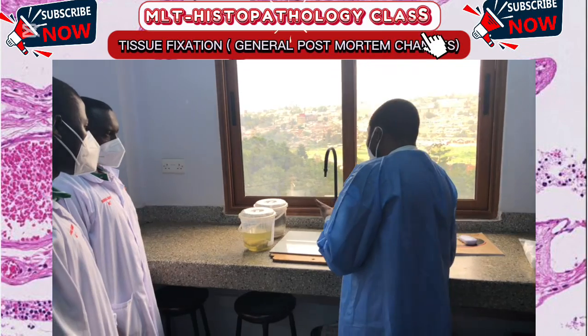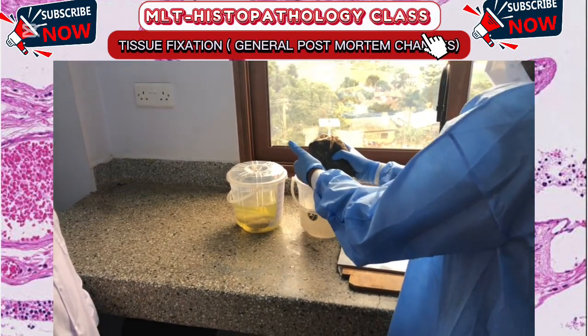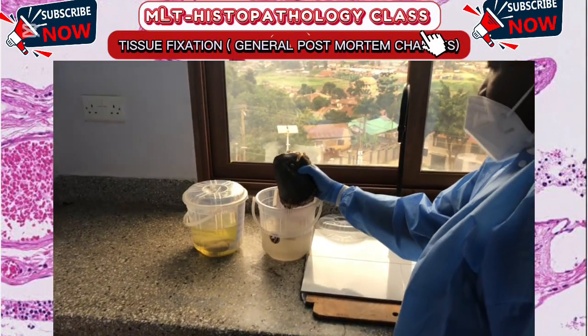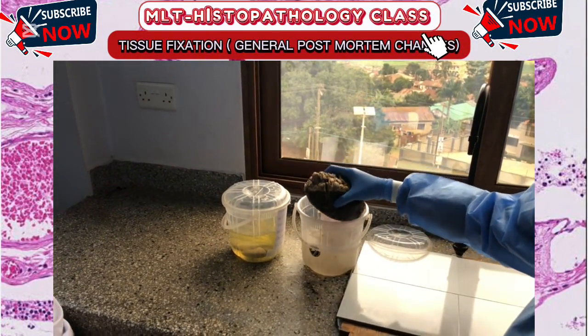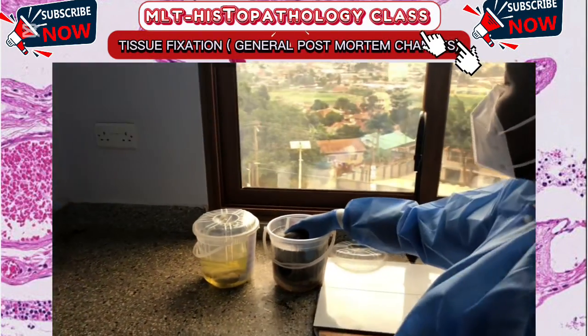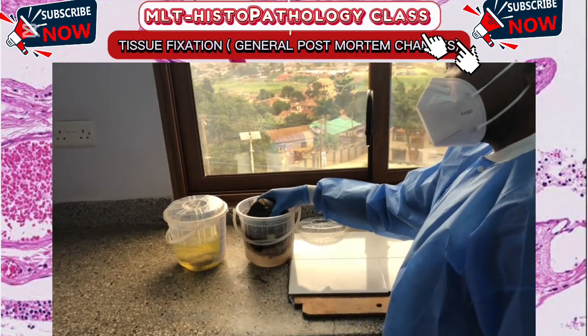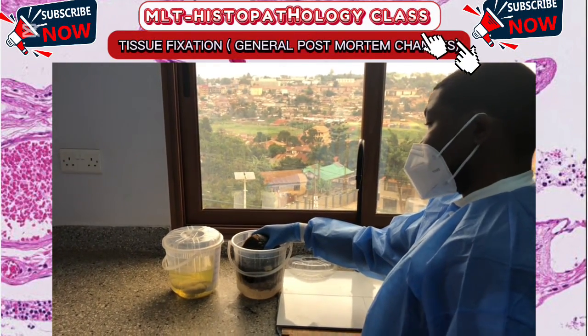So as we have said, we have our two samples. When you look at this sample, this is a breast tissue, but it is in what? It is in fixative, 10% neutral buffered formalin. The essence is to arrest post-mortem changes.